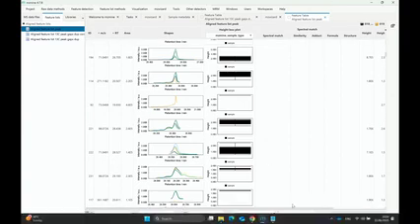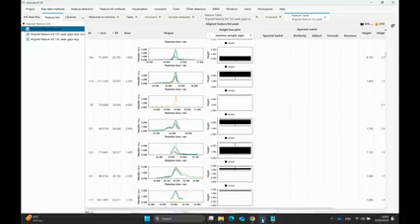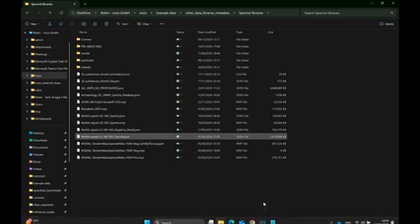And with this, we can go over to spectral libraries. Maybe just one note for the question for the audience while Robin and Corinna do the switch.